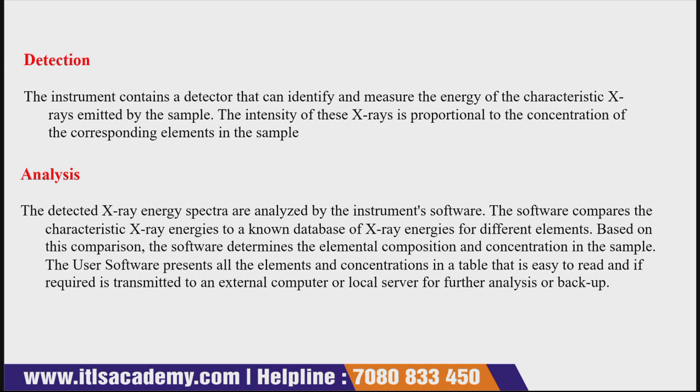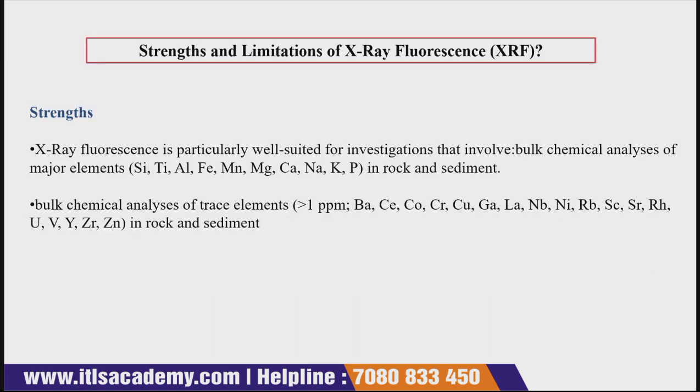Okay, so now we come to the strengths and limitations, or you can say advantages and disadvantages, of X-ray fluorescence spectroscopy.